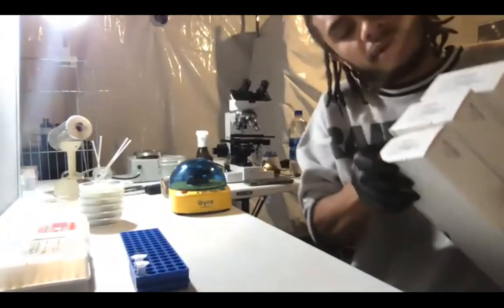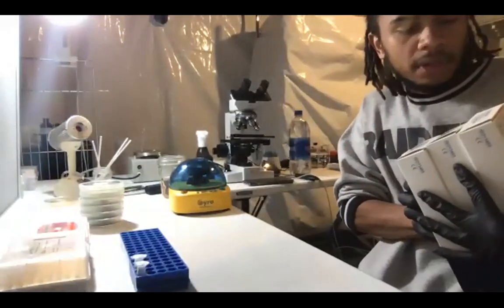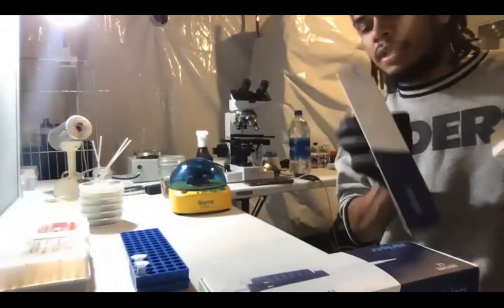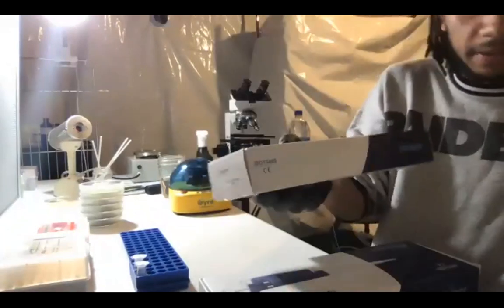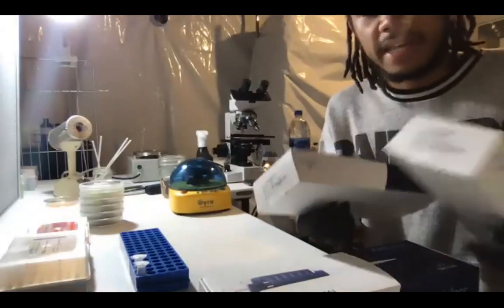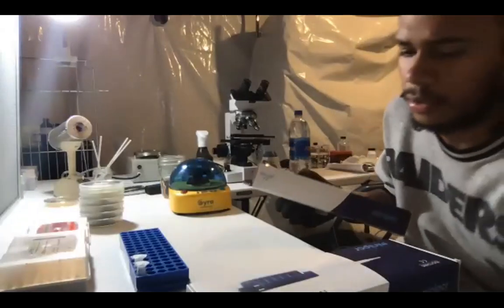I have three different sizes of pipettes here. I only really need to use two of these for most of what we're going to be doing. So I have the 20 microliter to 200 microliter that I'm going to be using a lot, and the smaller one, 0.5 microliter to 10 microliter, I'll be using. The one that goes from 2 to 20, I don't really need that much because this one goes from like 0.5 to 10, and this one goes from 20 to 200. So there's not really much I need to do in between there.